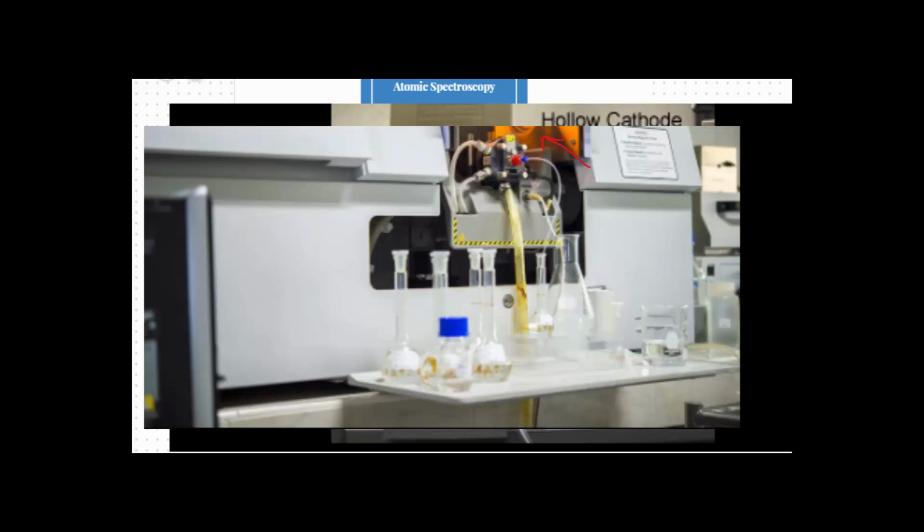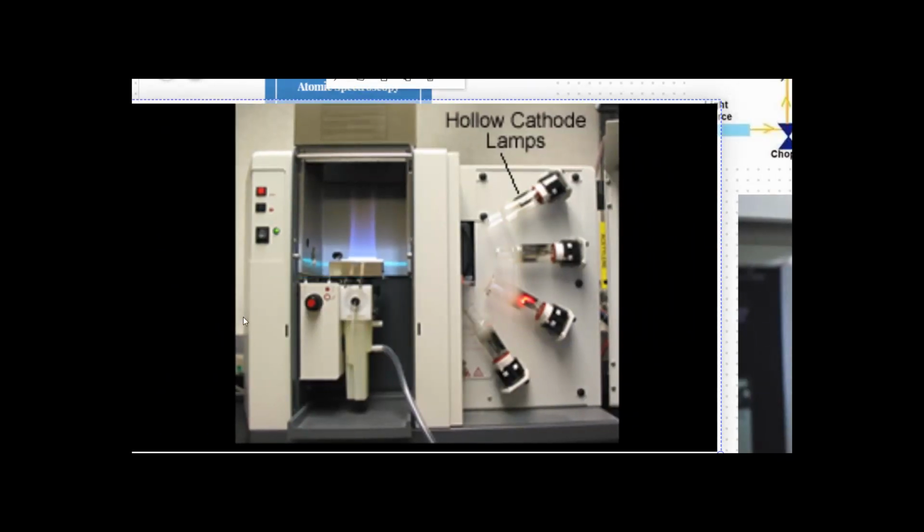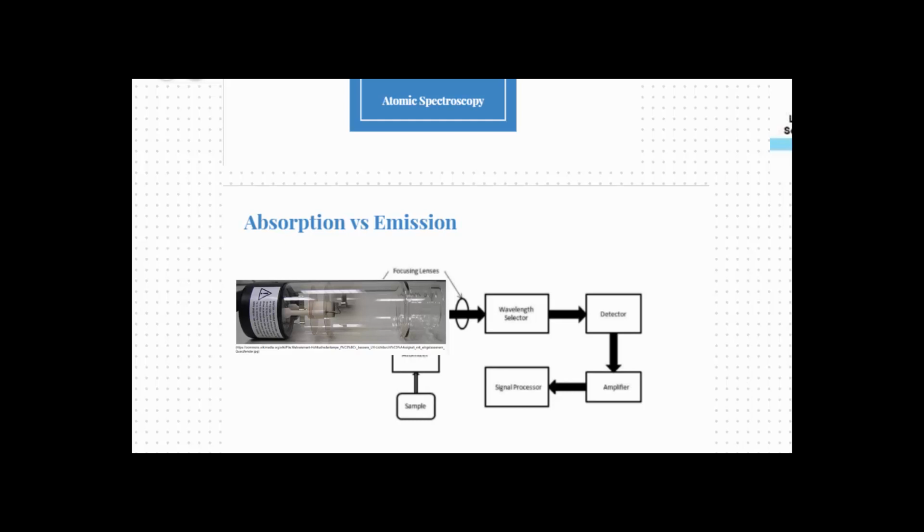Or you're analyzing sodium. Now, this picture in particular, hopefully you can see it, but there are these little tubes down here. These are your sample inlet tubes, and as much as possible, they need to be in liquid. So what we're analyzing with a flame AA, not EA, but AE, we're going to be looking at things that have been solubilized. Usually these are water containing, aqueous samples. So when you're not analyzing a sample, your little tube here needs to be in deionized water. Because we are primarily reading metals with these machines, you need to make sure that you are using deionized water and not just distilled water.